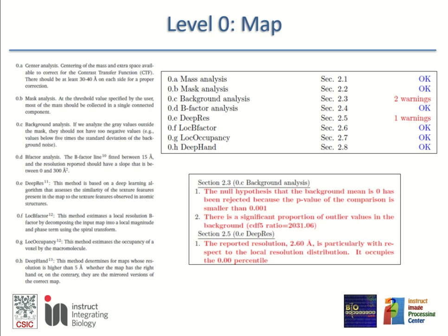The CTF extends 30-40 angstroms around the structure, and if you don't have this extra information, you cannot properly correct for the CTF. You do an approximation, which is sometimes pretty good, but that depends on the defocus, but you don't have enough space. You can also check whether the threshold that you have given gives a smoothly well-connected mask, or it scatters the mask into many small pieces.